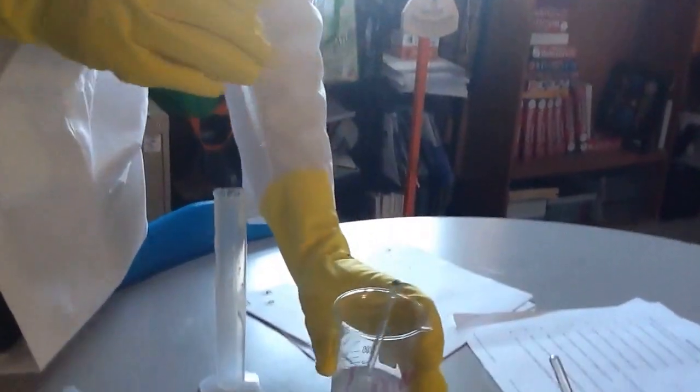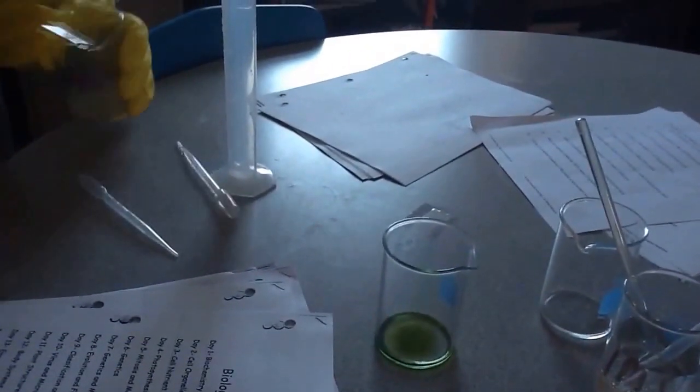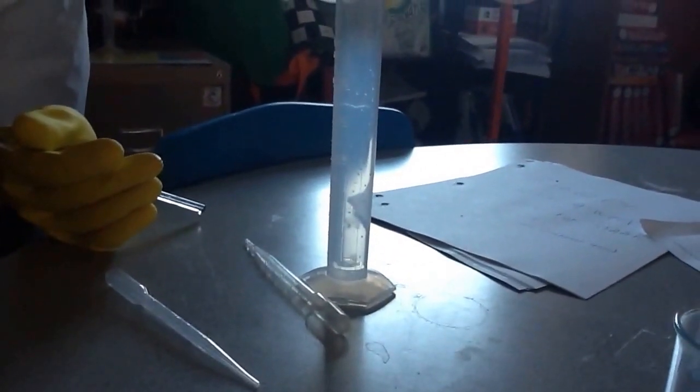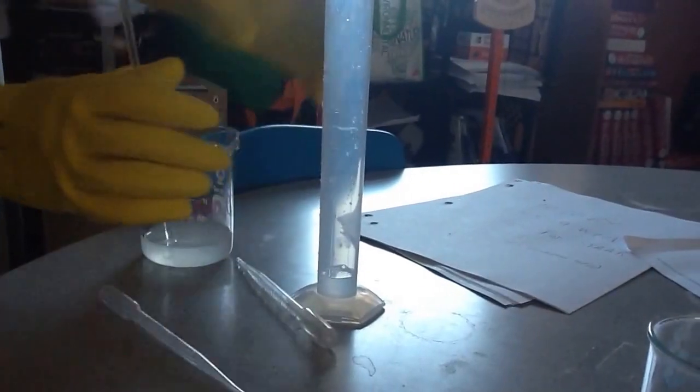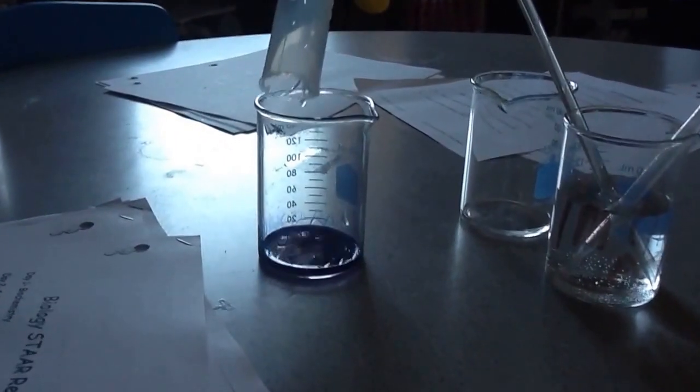We're going to do NaOH in the first beaker. That's in green. I'm going to add approximately five milliliters. So over here, five milliliters of NaOH will go in the green. You notice the color change, right?